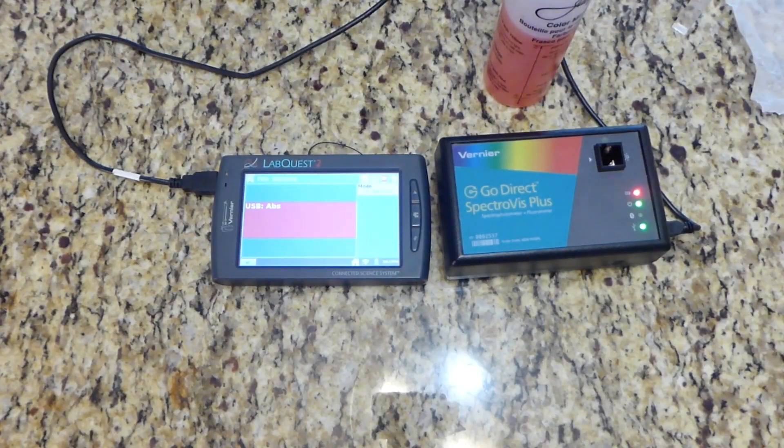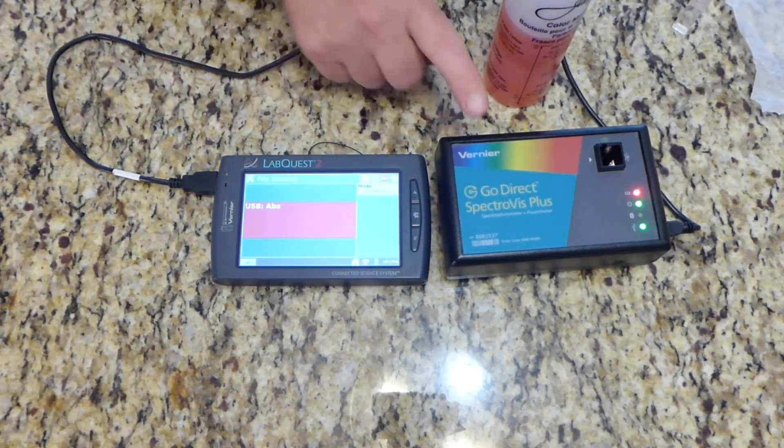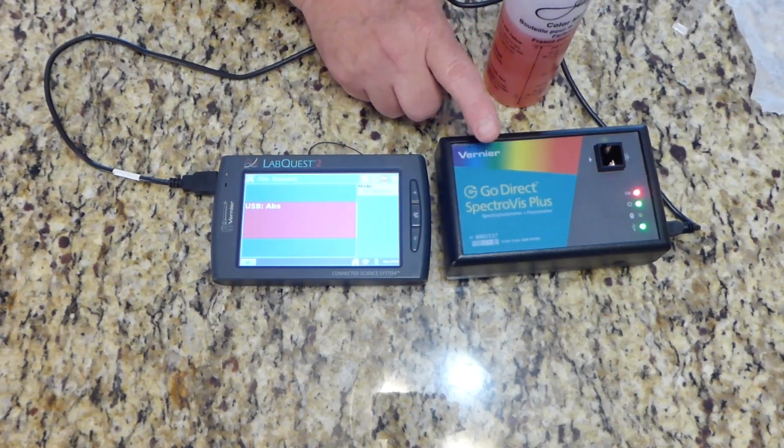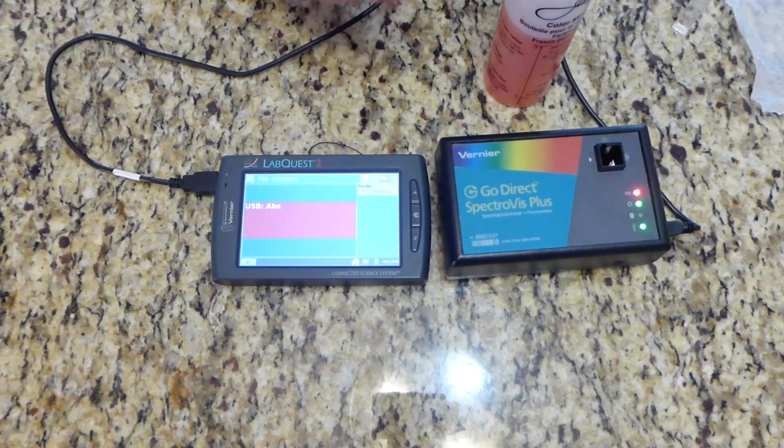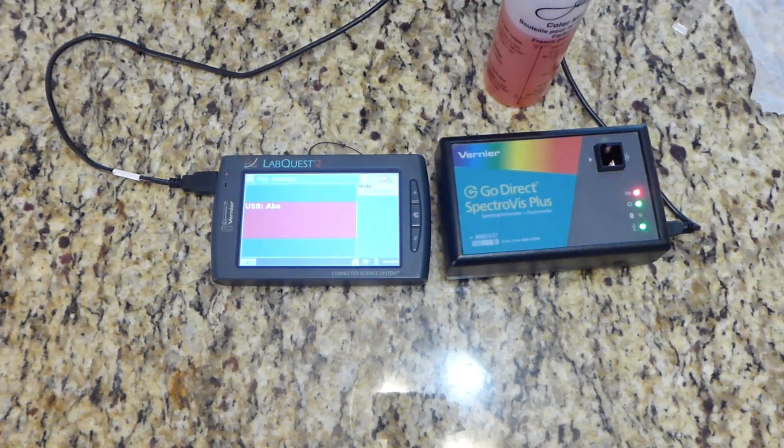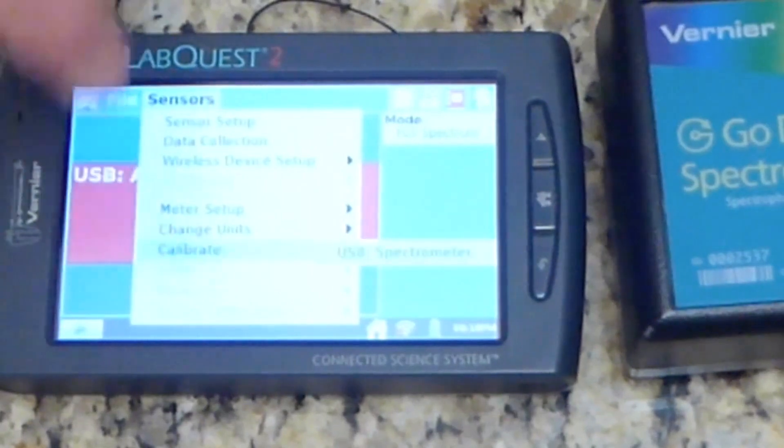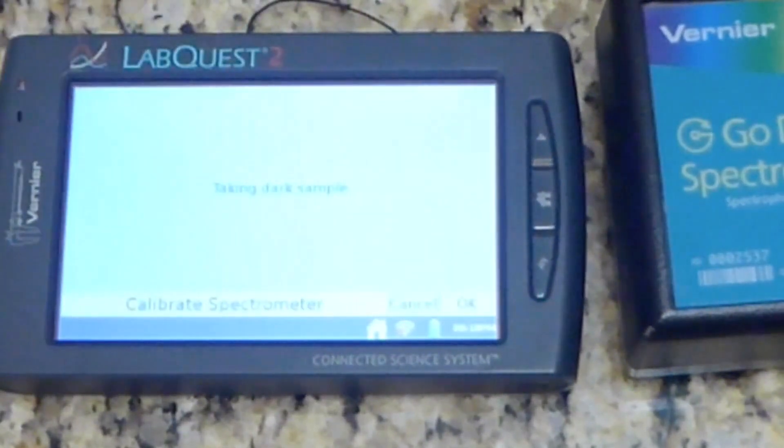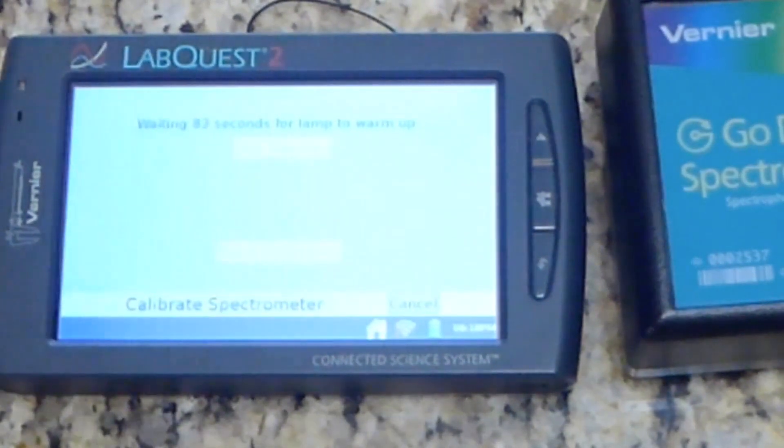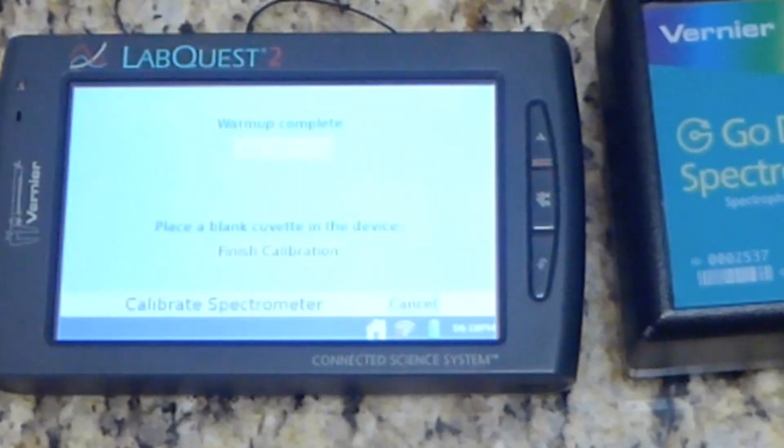There's another device that you can use. This one is called a spectrophotometer. This is different from a colorimeter in that it measures all the different wavelengths at one time. Once you plug it in, it'll automatically recognize what it's connected to. You push sensor, calibrate, and then UV spectrophotometer. It'll take a reading of just in the dark, so nothing in it. And then you have to wait for 90 seconds while it warms up.